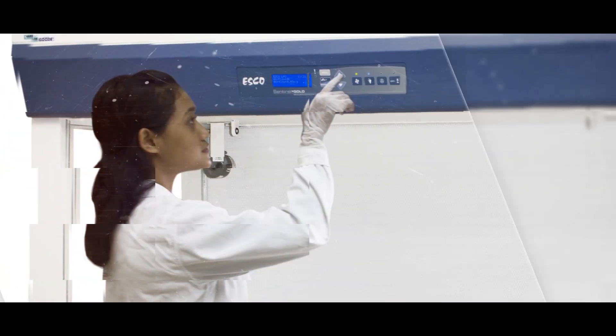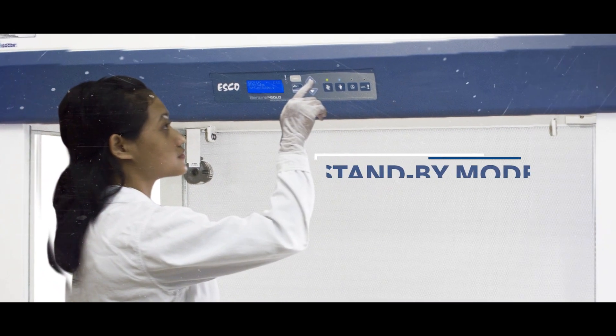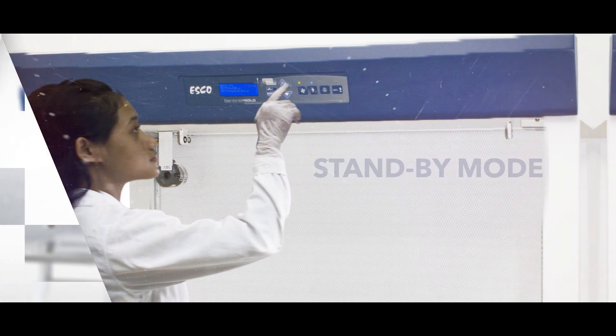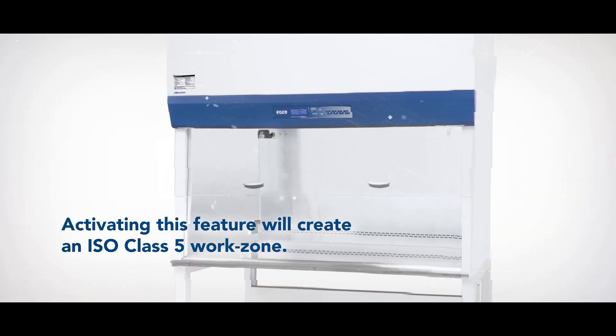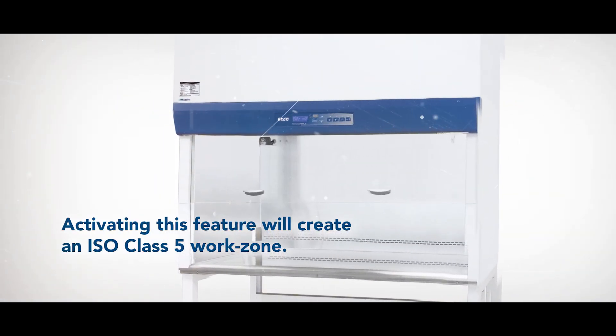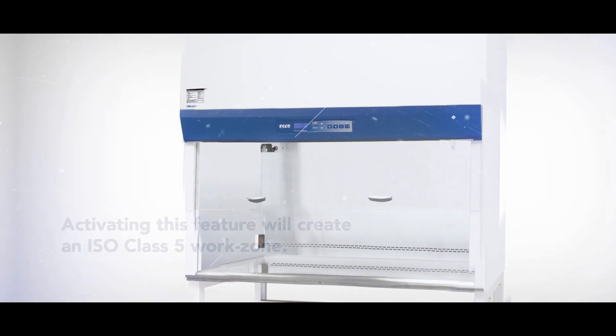The vertical cabinet can operate in standby mode to further reduce power consumption up to 60%. Activating this feature creates an ISO Class 5 work zone.